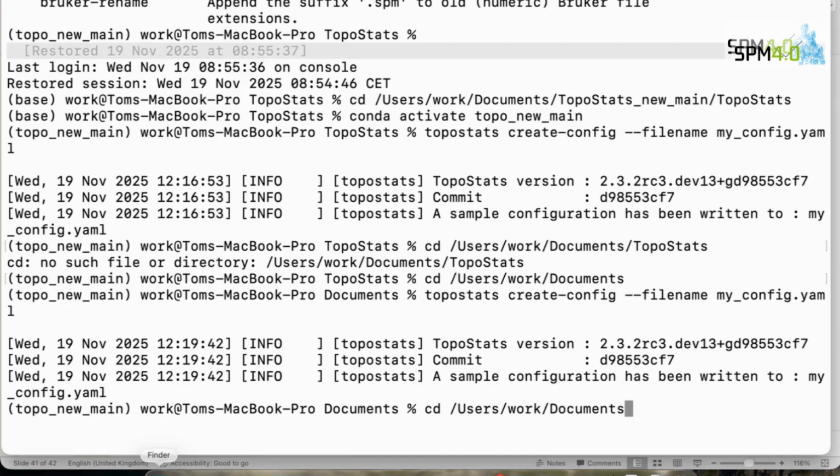So this is how we're going to run everything. We have the directory where your data is. Then the filtering steps are basically the pre-processing: we have row lines, thresholds, flattening, the Gaussian filter size you want to apply, and scar removal. Then grains: this is grain finding, so it's masking the grains that we saw.